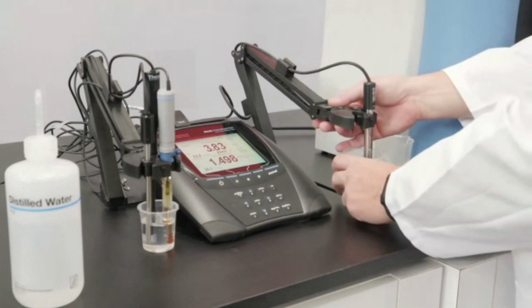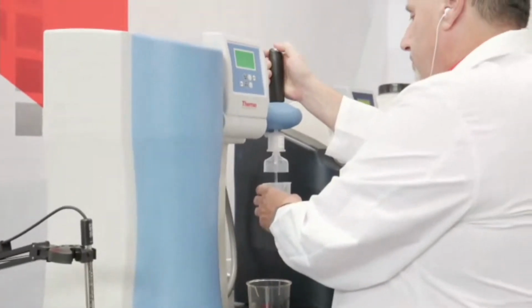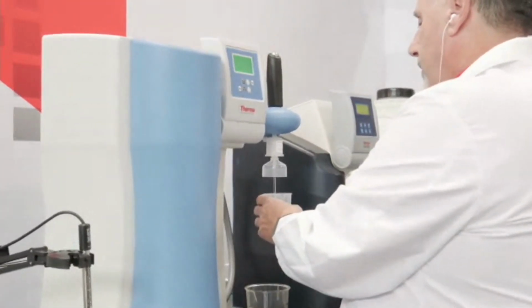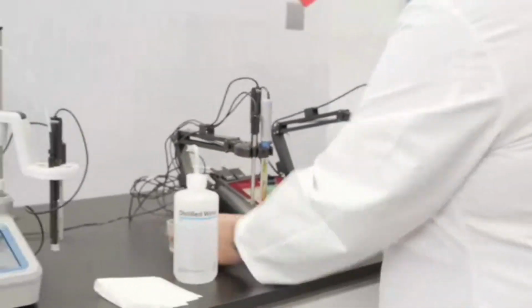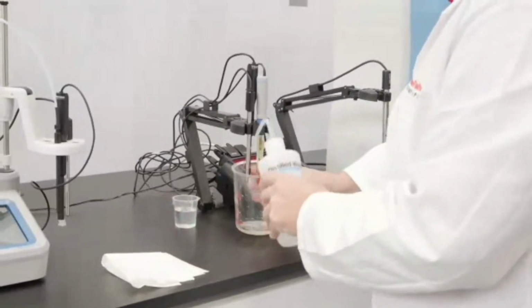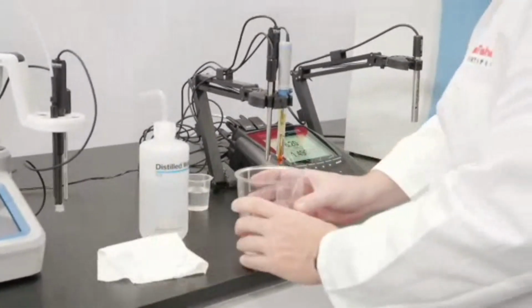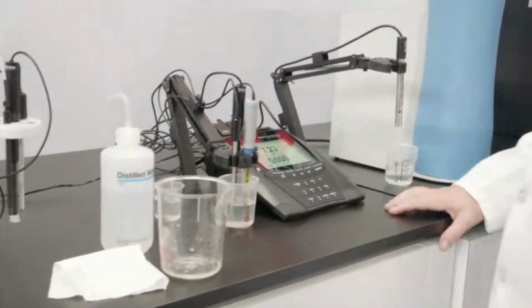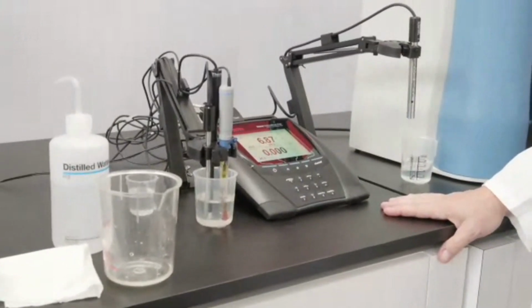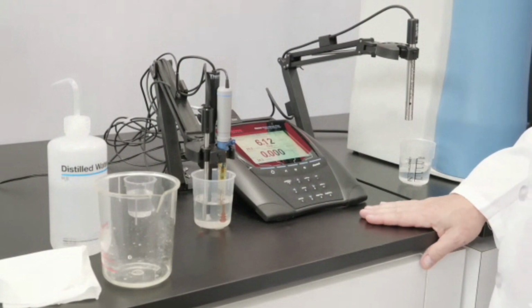Next, let's measure the pH of that sample. So we'll take another aliquot. We'll rinse off our pH probe and measure the pH. It started at 7, but it's quickly dropping just that fast with the CO2 absorption into the ultrapure water.